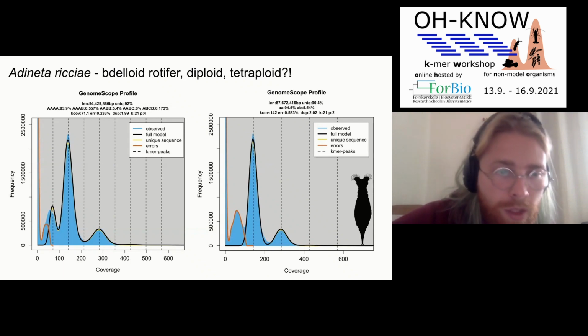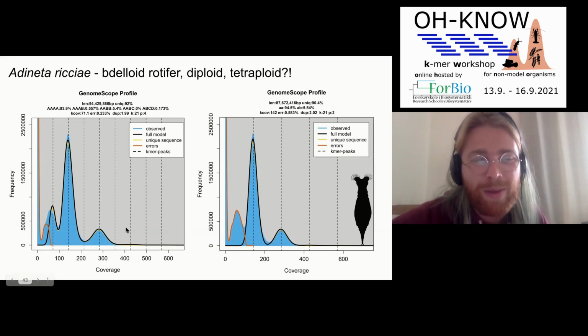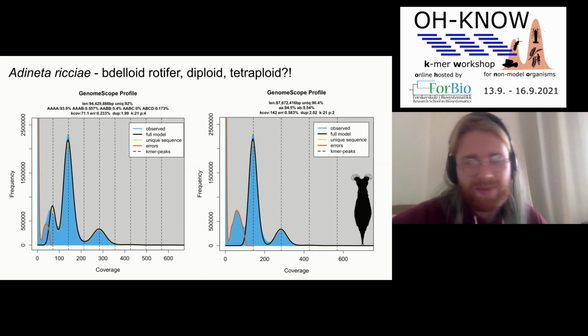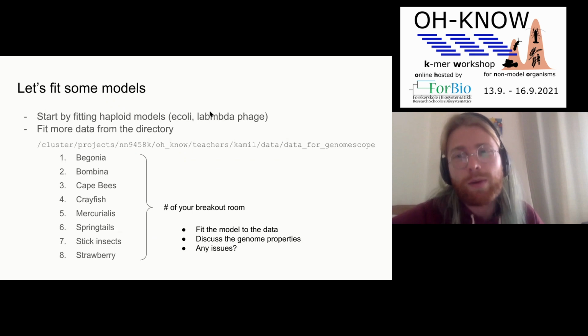And we have one more question. Is there a particular reason why we use K equal to 21? It's just a sweet spot. It's a sweet spot where you already have high complexity and it's low enough for you to have decent coverage. But there is no particular reason for it. There are people doing mostly 31-mers, people doing 27-mers. 21-mer is just my Kmer.